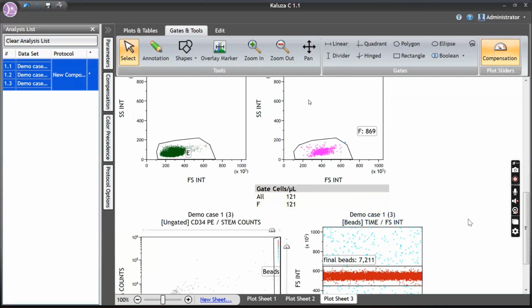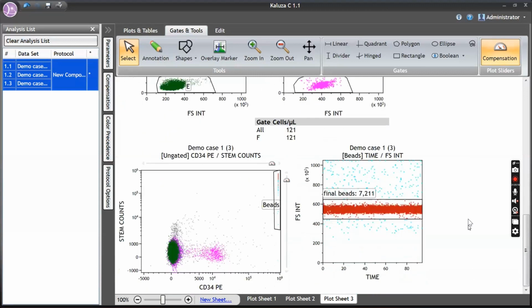In case you get a product, you use the same protocol, same method, but there you need to correct for the dilution. Say for example, if you have diluted the apheresis product in 1:5 ratio with PBS or something, then you need to multiply it by 5. Okay, so that is how you do it.